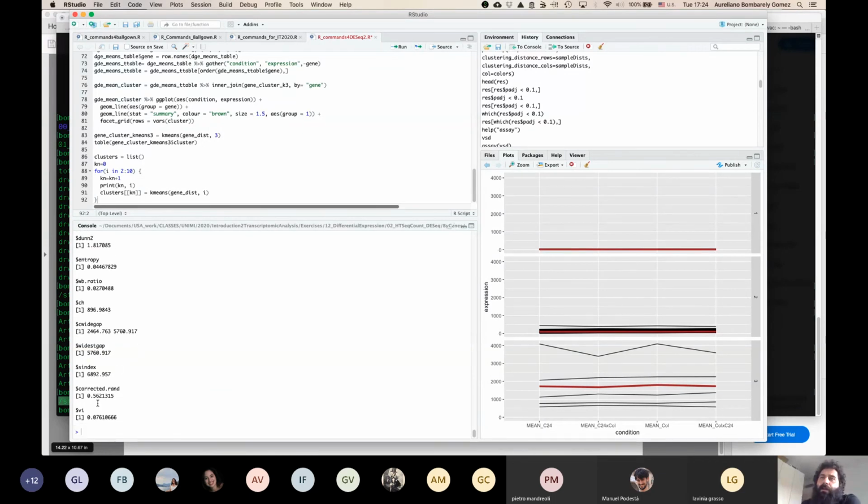You remember that when I presented the presentation, you have different options. You also can measure the gaps and so on. But as I said, I will not go there. That is the tool. Okay, questions that you may have about this. As I said, that is the last part, where I show you the tool, but not evaluating each of the parameters, because it can take a long time to explain them.